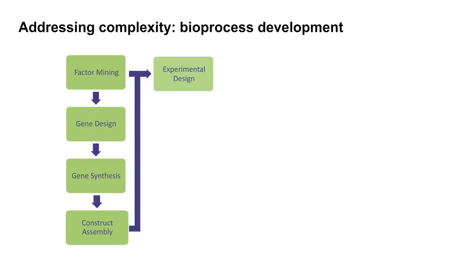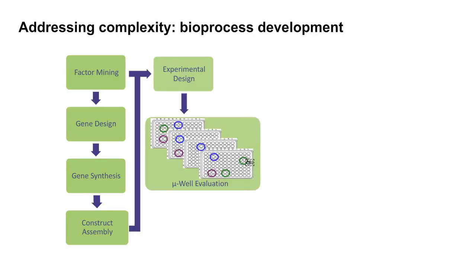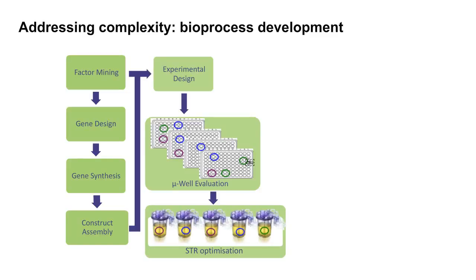All of that is ultimately used to build organisms that we're evaluating in a scaled-down environment, in our case, microwell titer wells, where we're recognizing what parts of the transferred context, ultimately large-scale fermenters, are we able to understand and unpick at this scale. It then means rapidly moving into stirred tank reactors. In our case, it's a system from Sartorius called an Ambr 250, which gives us a context-appropriate environment for understanding the physical interactions going on with our organisms.